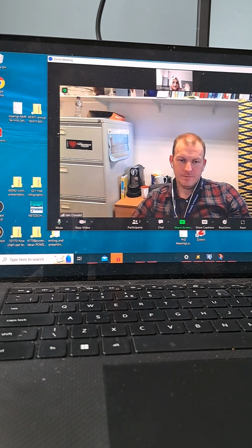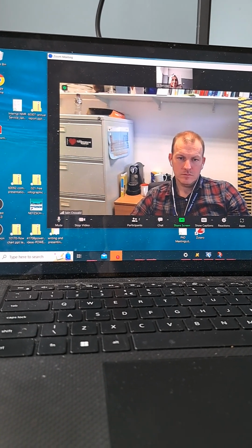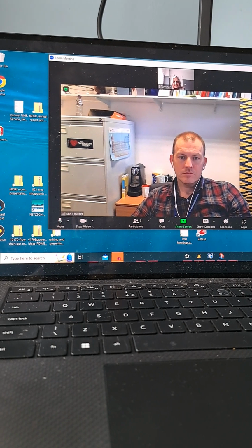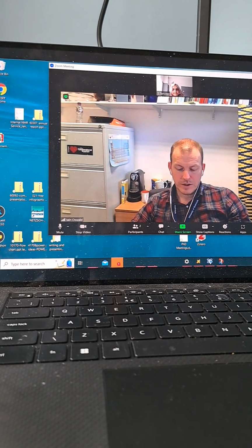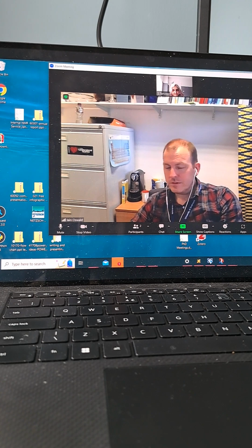Now I know that it is disproportionating at 3.6, but now I want to know what is the lowest pH where it is stable. That's the thing which I have planned. Okay. I'll just keep a note of the observations you've got as well, and those visual observations are good to have as well.